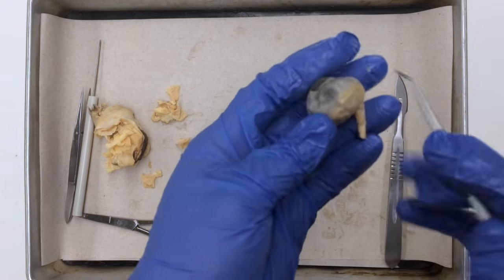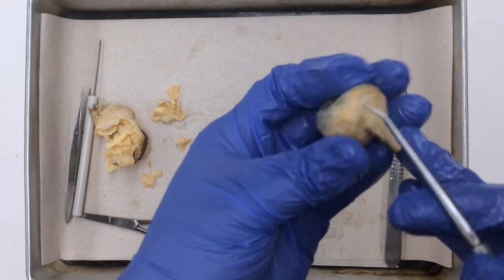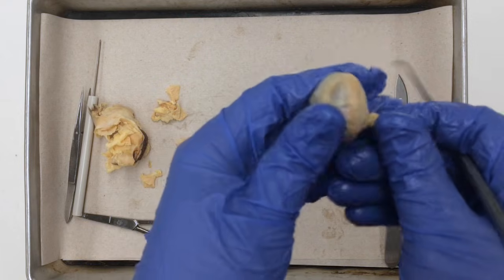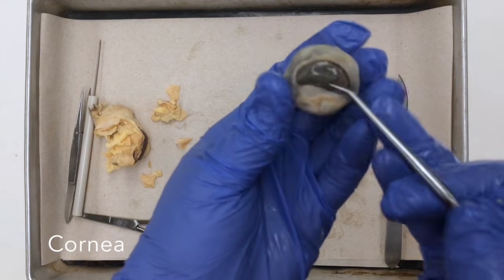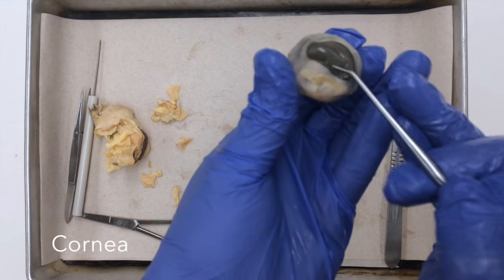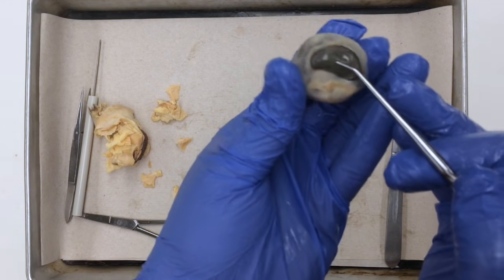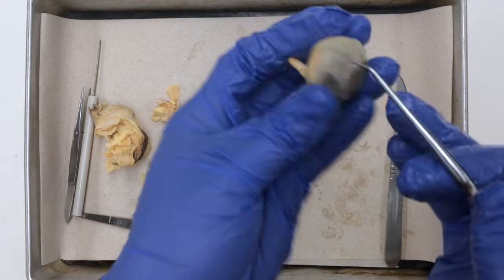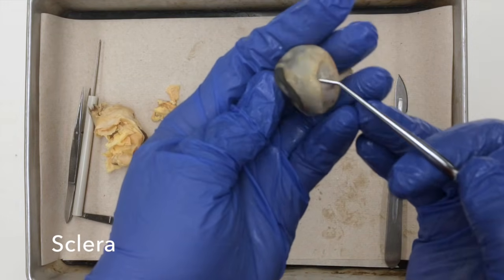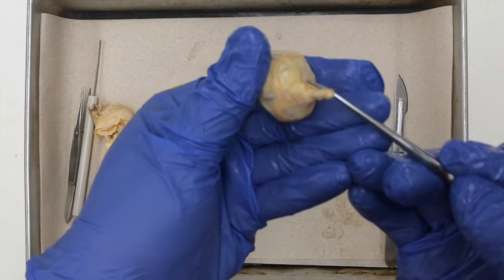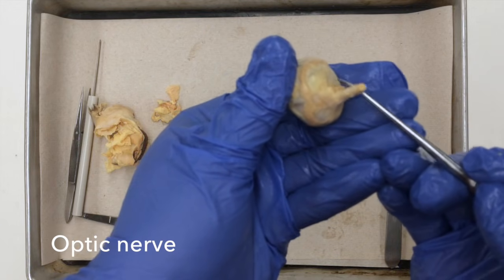Now that we have removed all of the connective tissue, the extraocular muscles and the fat from the eyeball, you can identify the cornea, which under normal conditions should be translucent, but since it's been sitting in solution, it's kind of opaque now. The sclera, which is the white of the eye, and the optic nerve or cranial nerve number two.